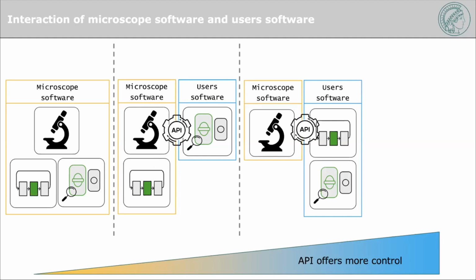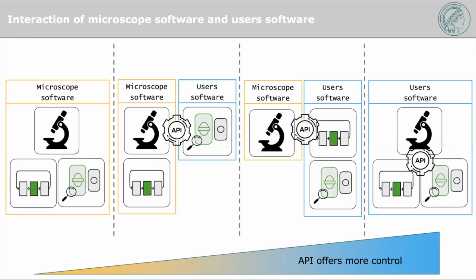It can be more and more that we even manage the workflow, so the microscope software is only needed to basically start the different imaging sessions, or having something where nearly everything is controlled by the API. It's still in the framework of the microscope software. So we're not controlling the single parts or the single mirrors, but we can send commands, and all the settings for the different acquisition can be described and set in the API.